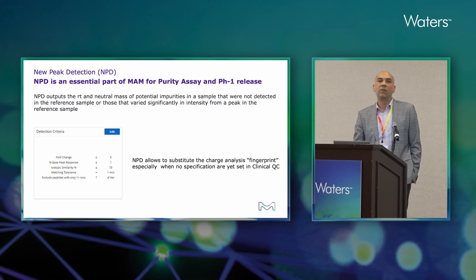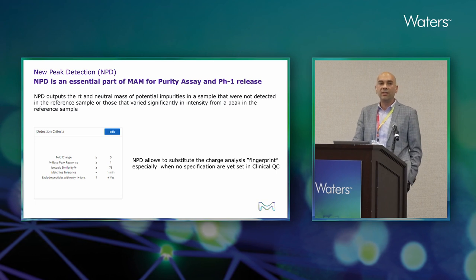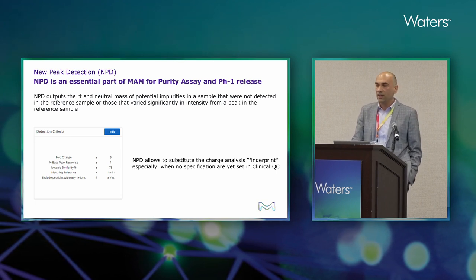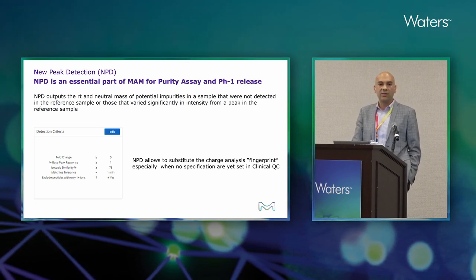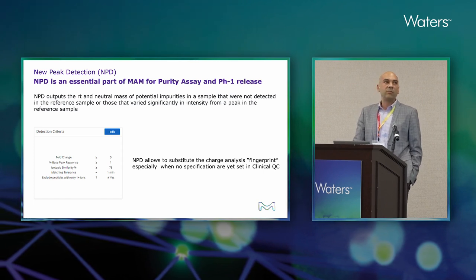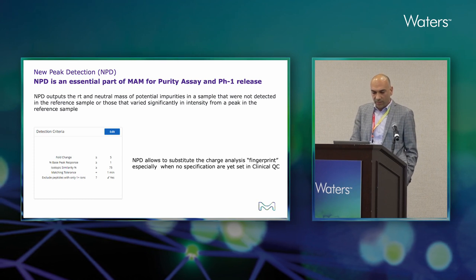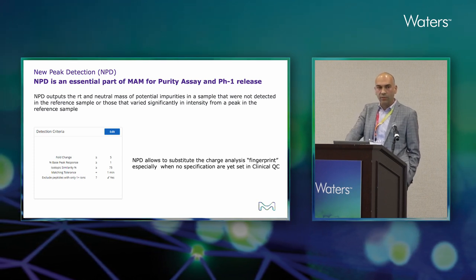What I said, one of the biggest challenges that I got internally from our regulatory colleagues is that if you stop performing charge analysis, you will lose this fingerprint view, and we expose the project to a risk. So how can we solve this? Thanks to new peak detection.